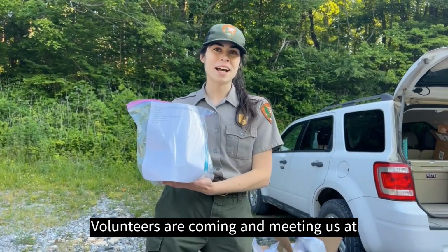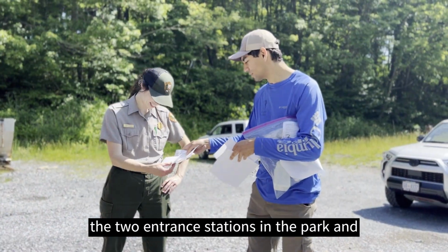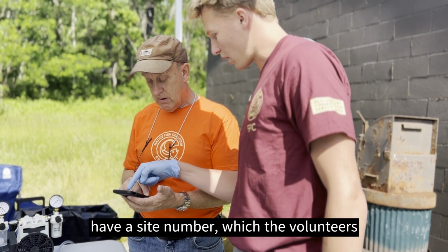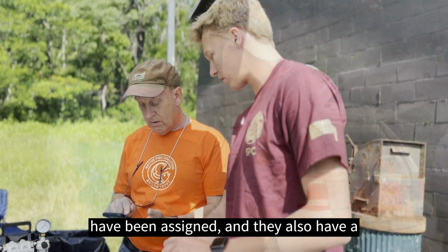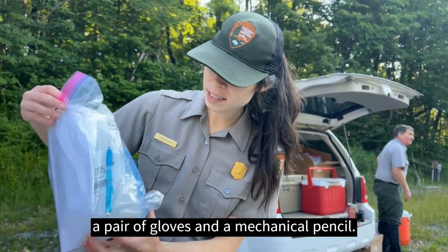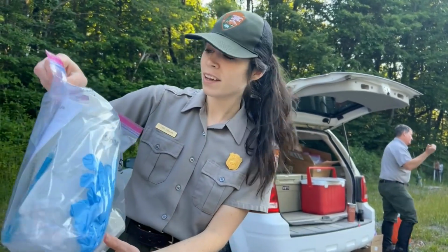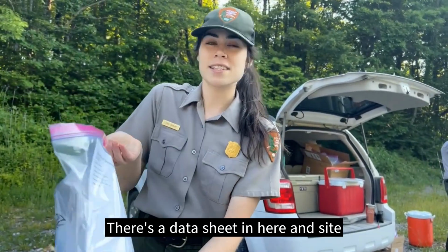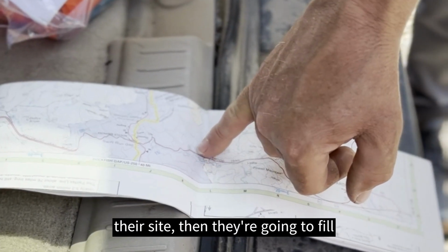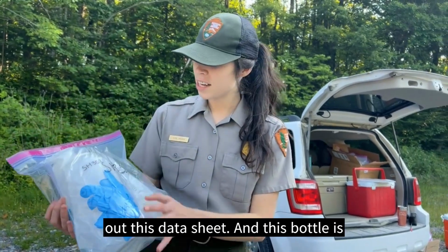Volunteers are coming and meeting us at the 2 entrance stations in the park, and everybody's picking up a kit. These kits have a site number to which the volunteers have been assigned. They also have a big 2-liter bottle, a little bottle, a pair of gloves, and a mechanical pencil. There's a data sheet in here and site directions. So our volunteers are going to follow the site directions to get to their site. Then they're going to fill out this data sheet.